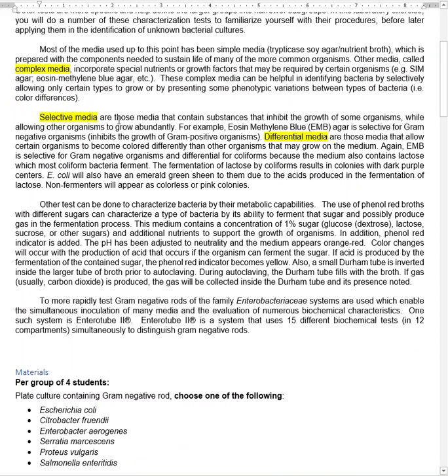Now the selective media, and yes, the media can be selective and complex, have certain substances which will keep some bacteria from growing. Eosin methylene blue, EMB agar: these two dyes, eosin and methylene blue, are toxic for gram positive. So that means on an EMB plate, you will be growing a gram negative. We don't use this to classify. We use our gram stain, but still, it's a good thing to have.